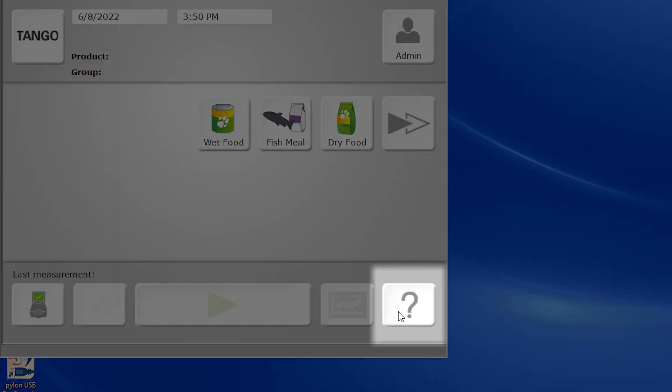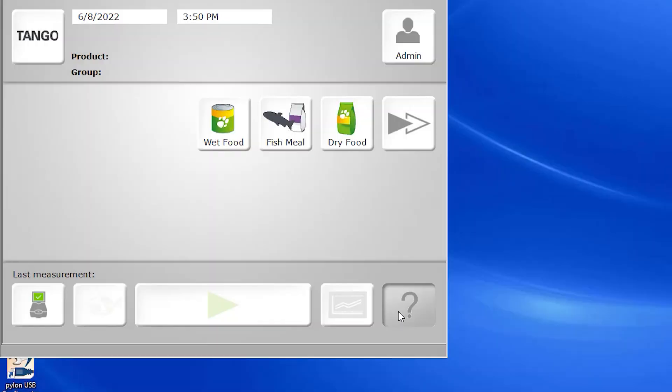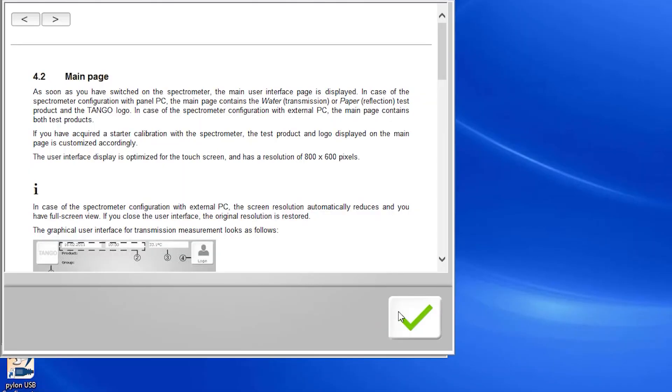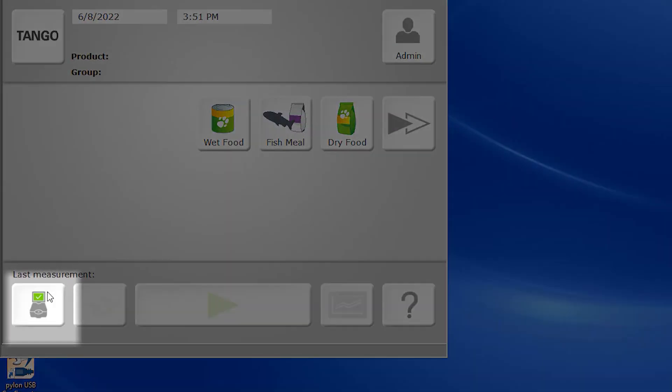In the lower right-hand corner, we have our help menu, which allows you full electronic access to your Tango manual. In the lower left-hand corner, you'll see an icon representative of the Tango instrument and indicators of the instrument's diagnostic health.